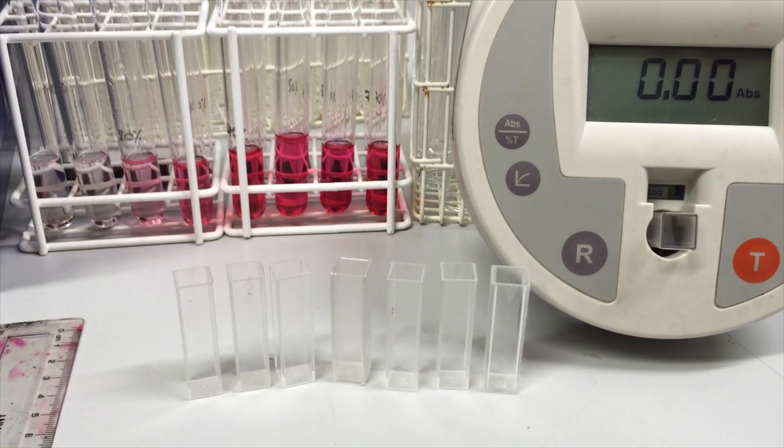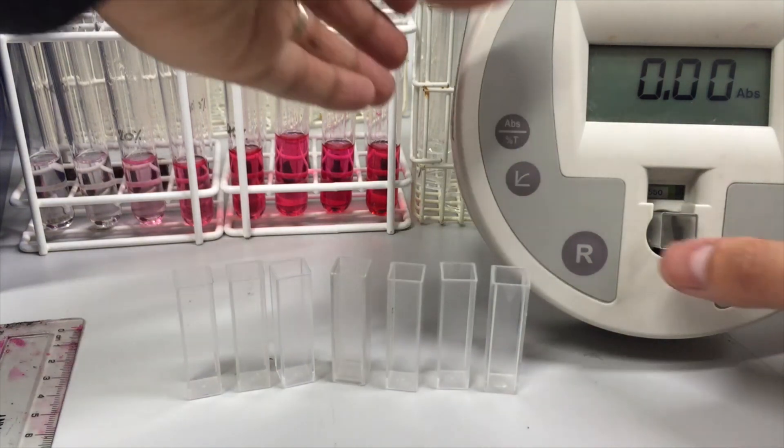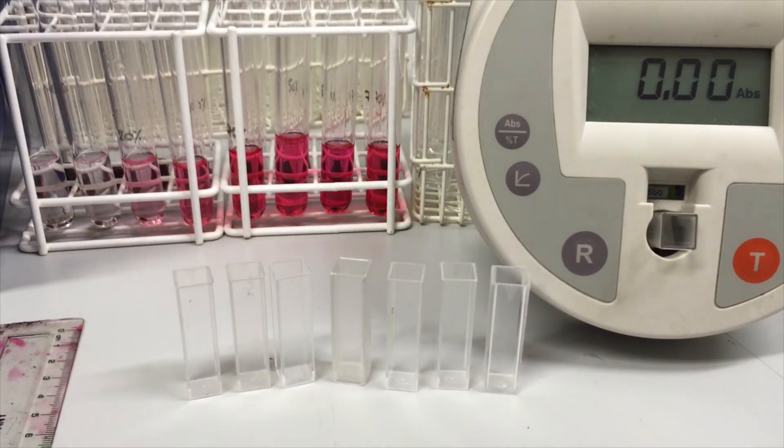Okay, right then. So let's begin. So the first thing we're going to do is set that filter up in there. So that's all ready to go. Then we put the water in the cuvette, put the cuvette in the colorimeter and take a reference reading. And that's zero.